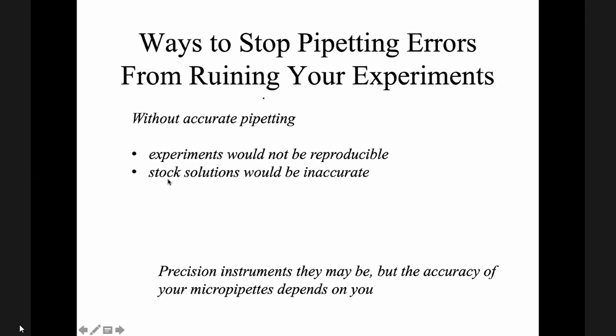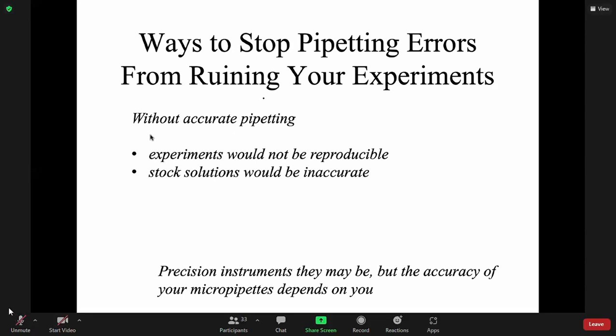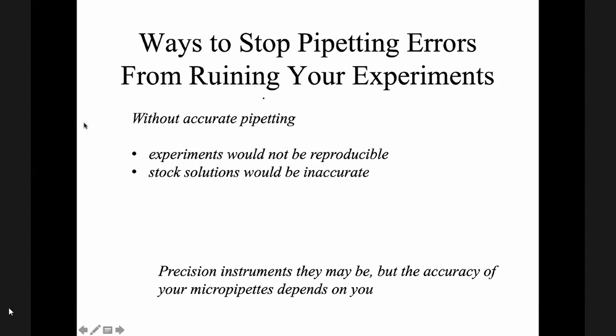Okay, so we are here pertaining to stock solutions. Di ba ang stock solution, dapat exact din na ang concentration or accurate concentration kay stock solutions. So if the pipetting is inaccurate, di ba kagina nagsabi tayo nga pipettes are used in pipetting ng mga aliquot. So if sala, syempre ang concentrations niyo in the preparation of your stock solution would be also erroneous. So okay.